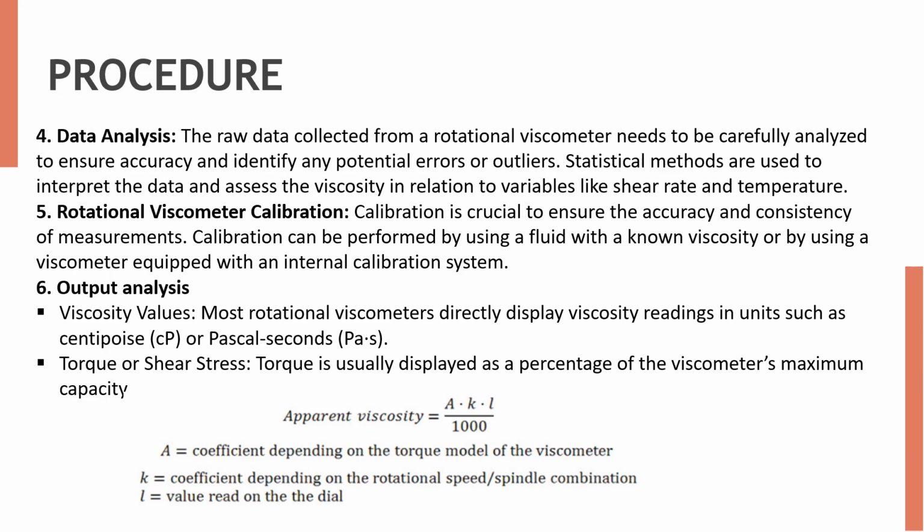Next is torque or shear stress. If we are using any traditional type of viscometer, that is viscometers like dial rotational viscometers, then the output is displayed as torque percentage. That is, torque is usually displayed as a percentage of the viscometer's maximum capacity. For this, you have to use a formula to obtain the viscosity values. That is, apparent viscosity equals A multiplied by K multiplied by L divided by 1000, where A is the coefficient depending on the torque module of the viscometer, K is the coefficient depending on the rotational speed by spindle combination, and L is the value read on the dial.